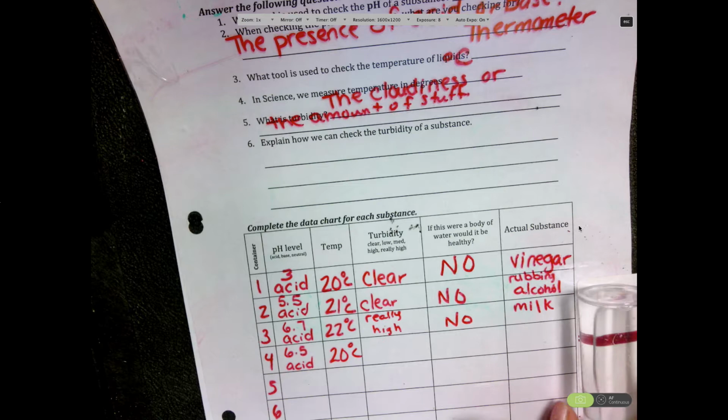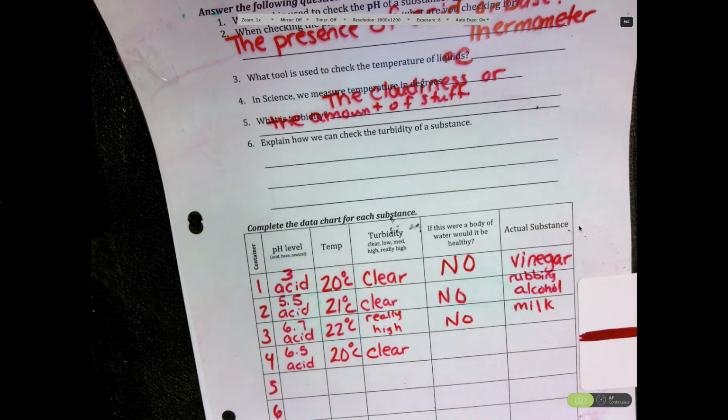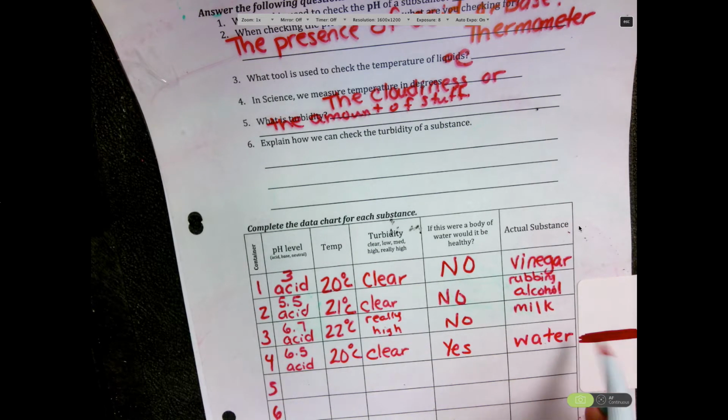The turbidity, clear. Did it pass the pH? Yes. Did it pass temperature? Yes. Did it pass turbidity? Yes. Is it healthy? Yes. Because it's water. That's all right. Number 5.